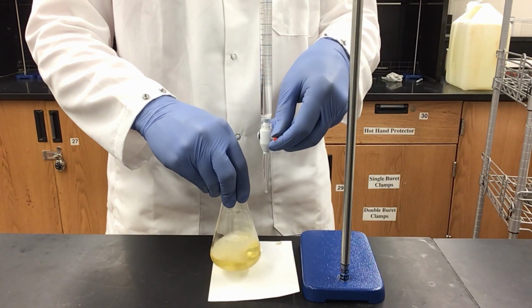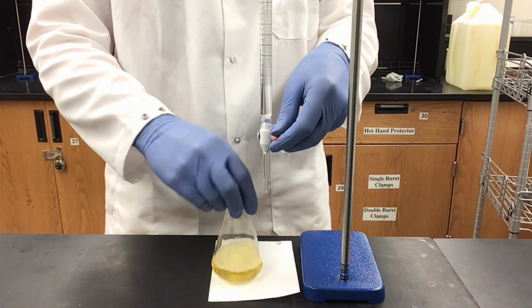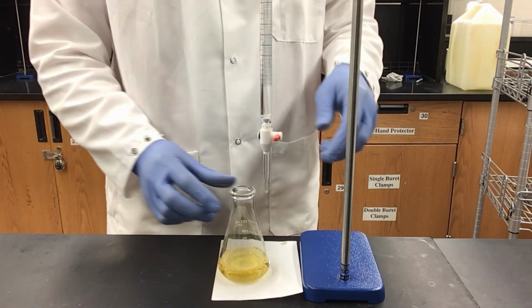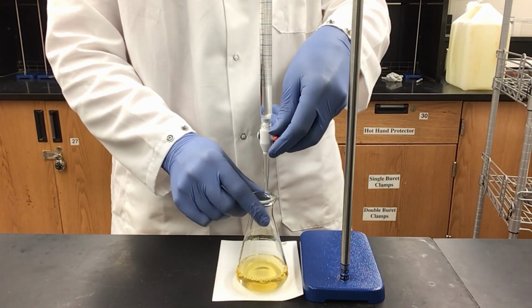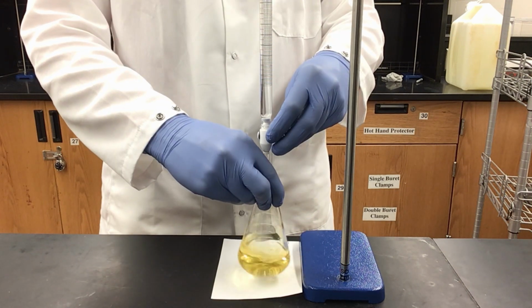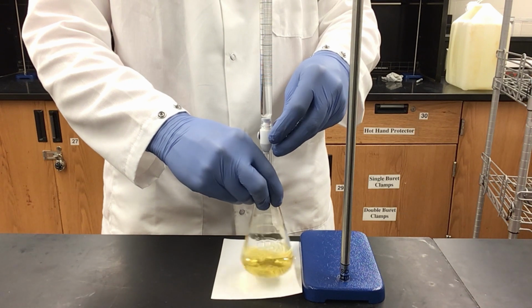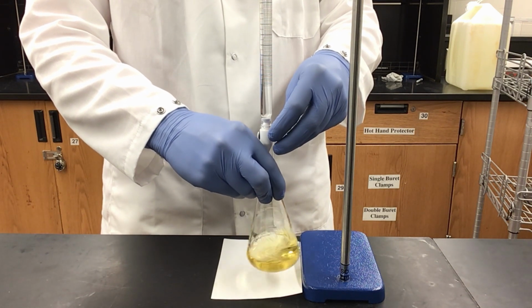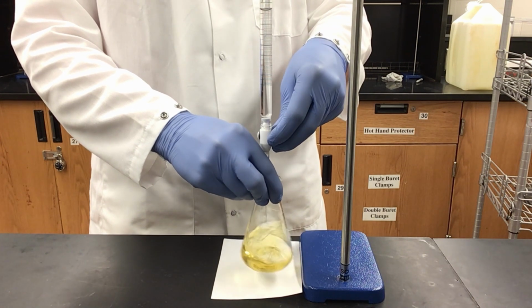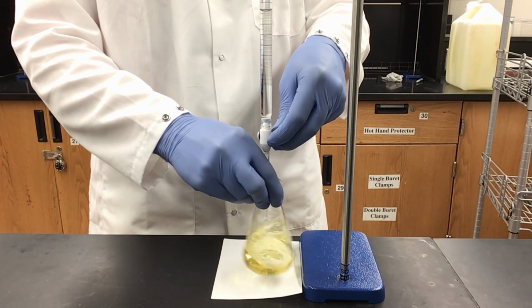I have quite a buildup of air bubbles in my solution, so I just want to swirl and let them settle before I continue. And there we go. Now that I've eliminated most of those, I can go back to titrating. I'm starting to have my blue color of indicator last in my solution, so I've slowed down to dropwise addition. My blue indicator is now lasting quite a bit longer in solution, so I'm very carefully adding 1 drop at a time.